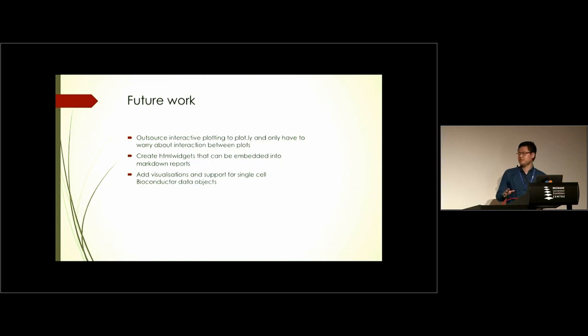I'd like to create some HTML widgets, which you can embed into R Markdown reports, which would be very nice. I've had requests to make my current plots embeddable into HTML widgets, which I don't really want to do because that tends to get squeezed down into a little column, and I feel like my plots deserve more space than that.